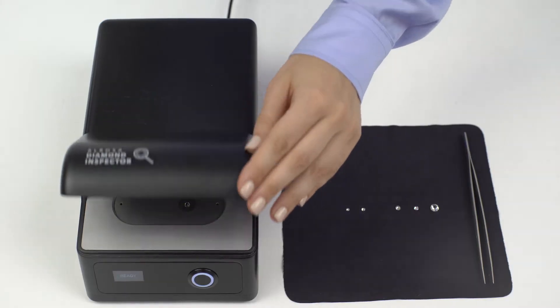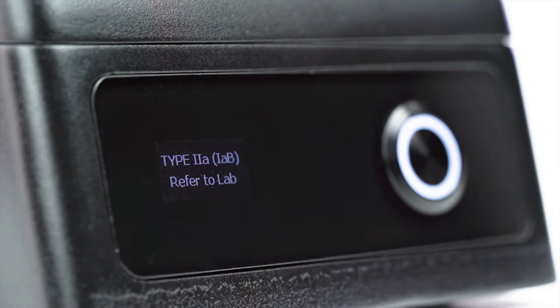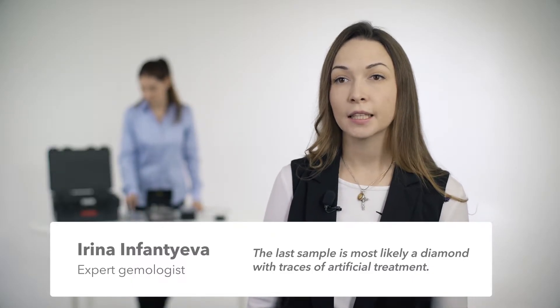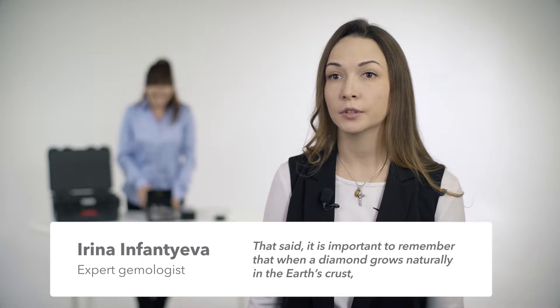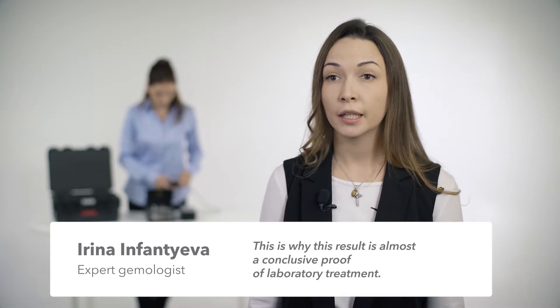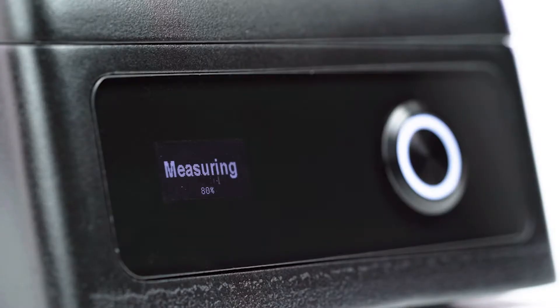Let's take a natural Type 2a diamond and test it in the device. As we can see, the result is predictable: 'Type 2a — refer to lab.' If the diamond has been enhanced, the device will show the result 'treated.' If a diamond fluoresces or has a non-typical luminescence, the device may show the result 'need investigation.'